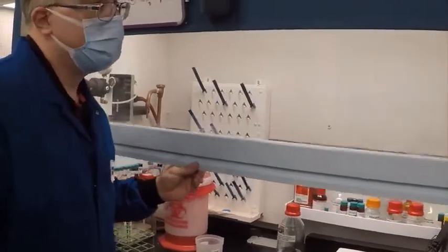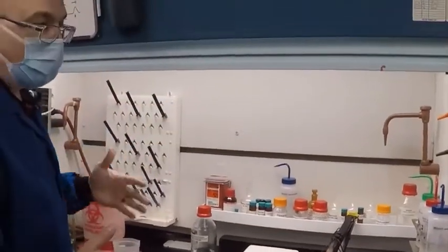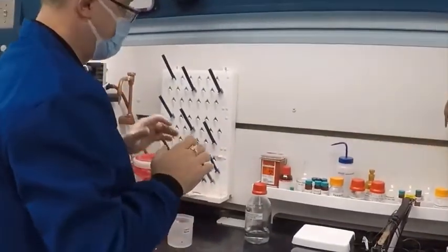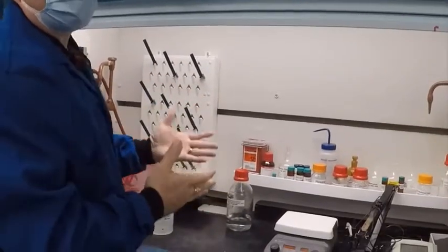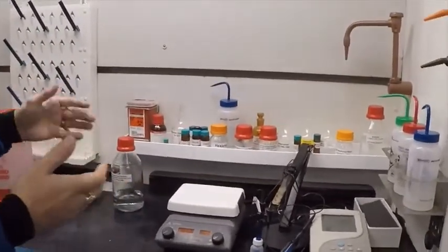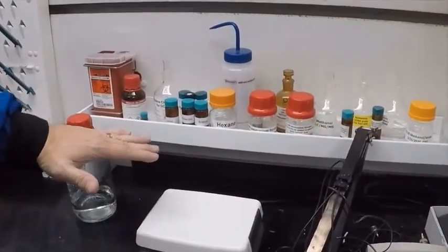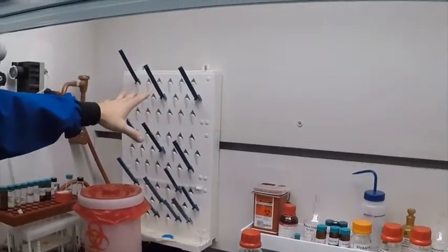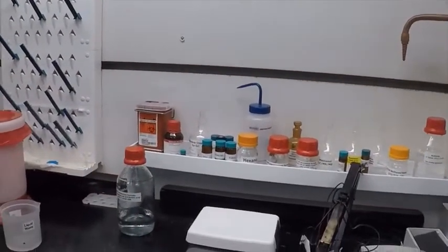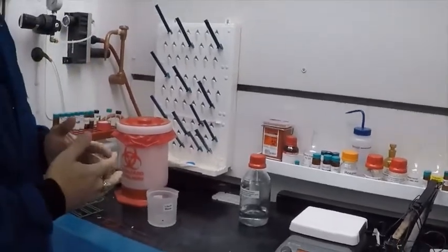Regarding handling things under the fume hood: you don't want to use your fume hood for storage. However, if you have common materials that you use on a regular basis, they can be kept in the fume hood as long as you keep them off the floor so you get the proper face velocity across the lower surface. Everything in your hood needs to be properly labeled, and you only want to keep items in there that you're going to be using on a routine basis. Everything else should be in its proper storage location.